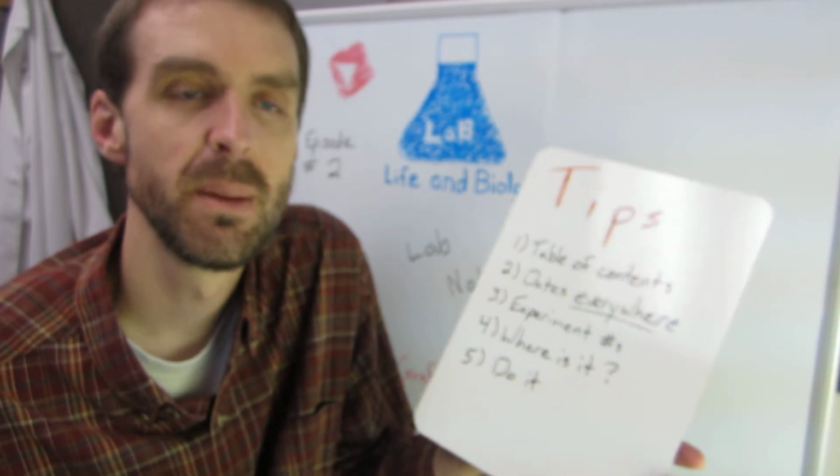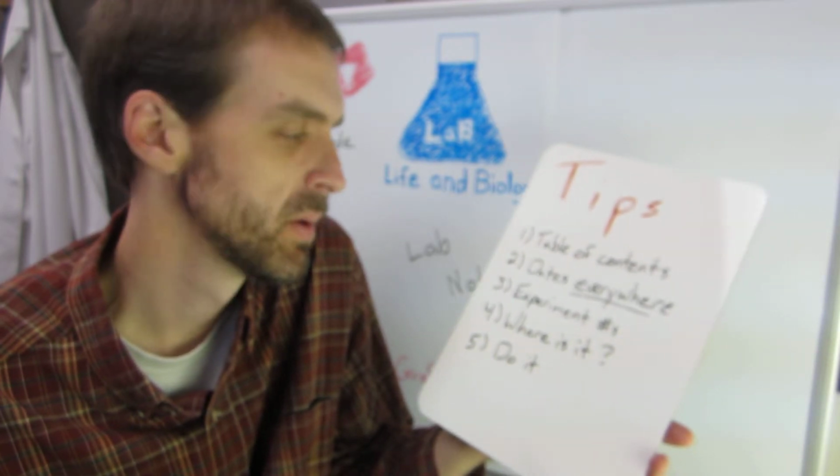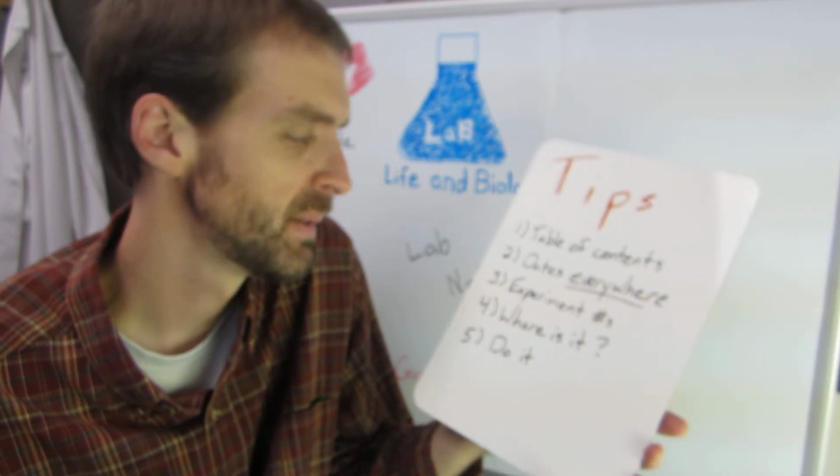Where is it? Maybe you're using a new kit. Maybe you have a new TaqMan assay. Maybe you collected a bunch of samples and they're stored in a freezer somewhere. Make a note of where you put it.